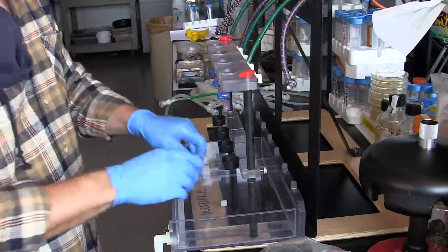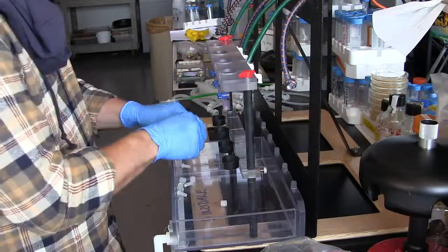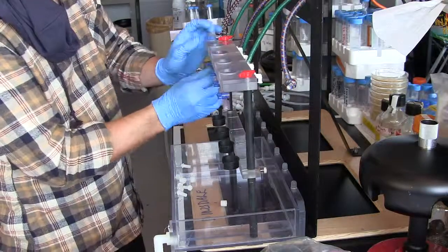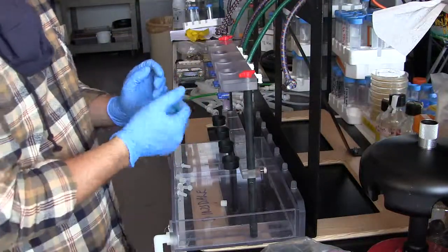Alright, now you don't want to over tighten these. It's actually very easy to snap off these luer lock fittings inside the plastic there, and it becomes a real pain. You have to get them out with a hex wrench. You have to ram the hex wrench into the thing and twist them out again.